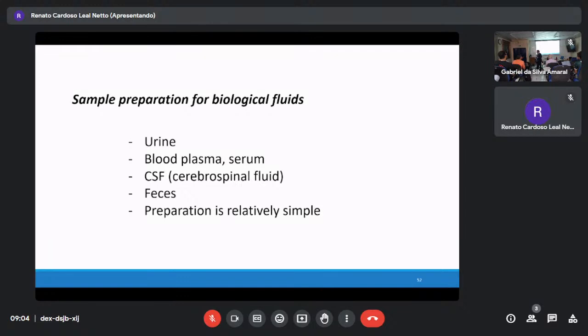And another issue. If you have human feces, is it only human metabolites? No. There is gut microflora, and you ate a salad today, plants, all mixed. That's why when you do urine or blood analysis, you can distinguish very easily. When you do component analysis, clustering is very easy, like the healthy control or the patient. They separate very well.